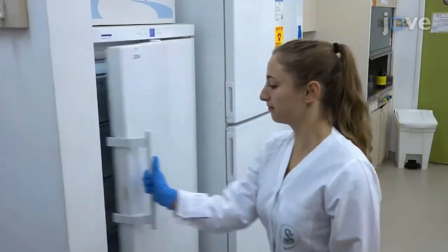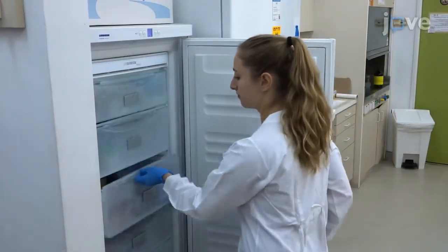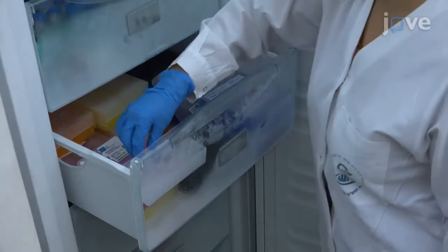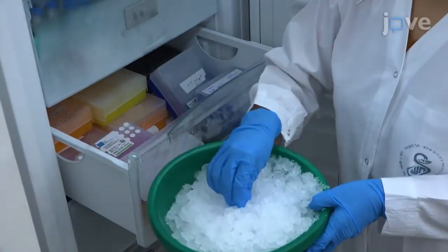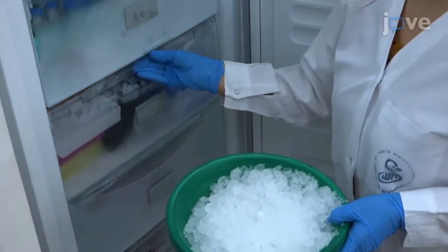Begin by performing digestion and cell lysis of intestinal biopsies. Retrieve intestinal biopsies, either freshly collected or stored at -20 or -80 degrees Celsius. If using frozen biopsies, thaw them on ice.